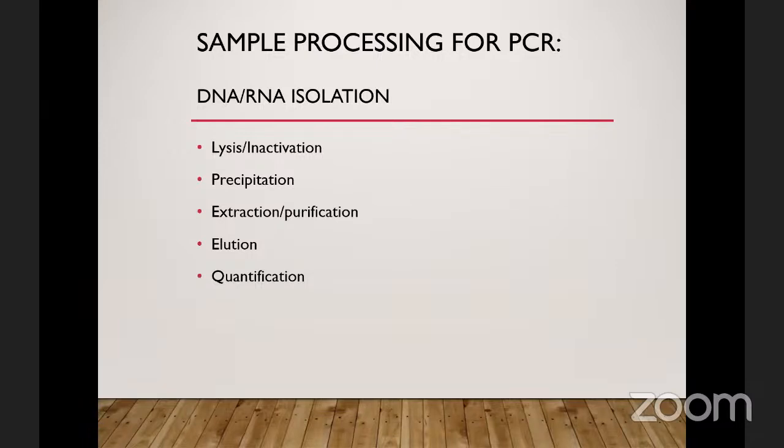Okay, so like I was saying, I was talking about lysis and inactivation. I said the cell itself is an intact environment. The nucleus inside the cell is also an intact environment. So for us to have access to the DNA for our testing, we have to first release all of those. I said we apply lysis buffer, which is made up of detergents, EDTA and some other components. Then we lyse the cells and inactivate.